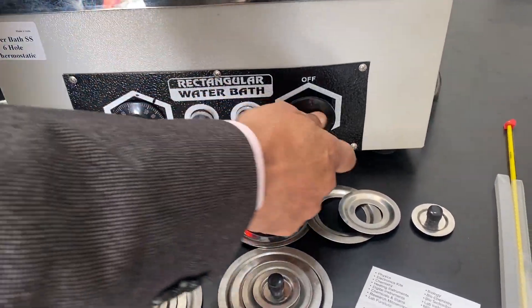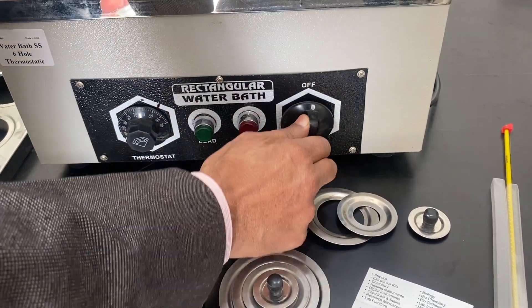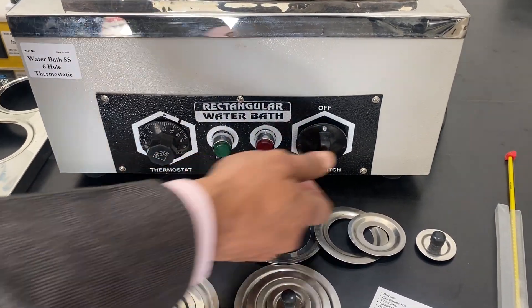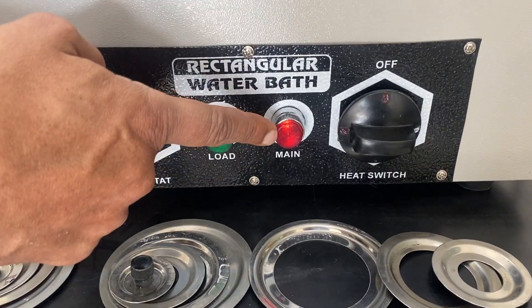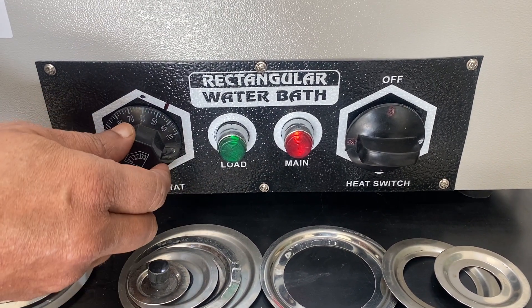It has two sections — one, two, and three — but only when it is on the top or bottom it works. This zero means no heating is going on; now this is totally off. With number one, heating is going on. This main red indication tells you that current is coming and the load means heating is going on.